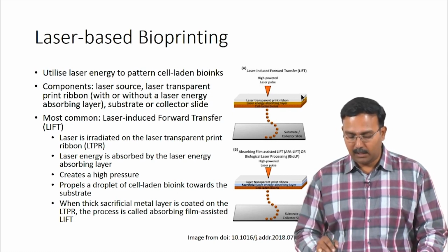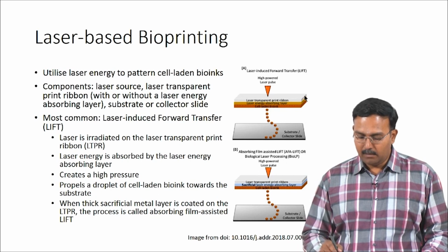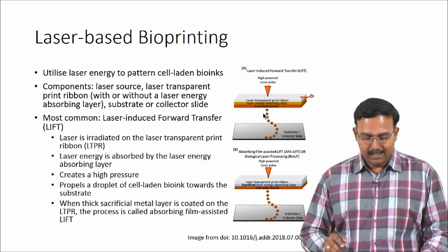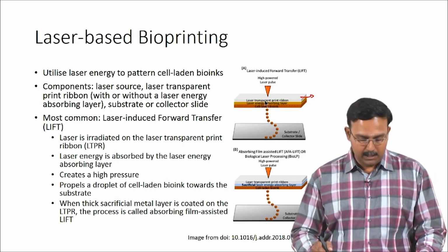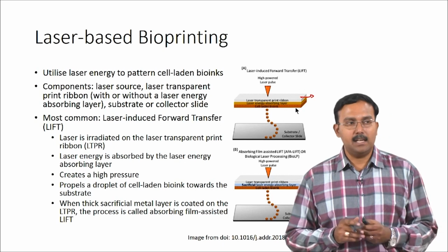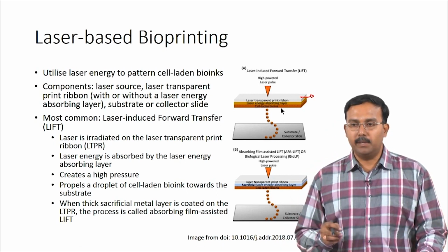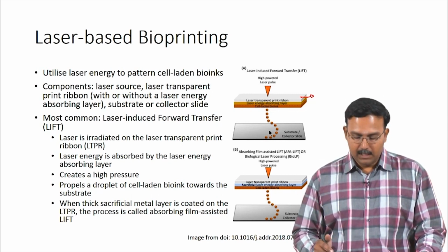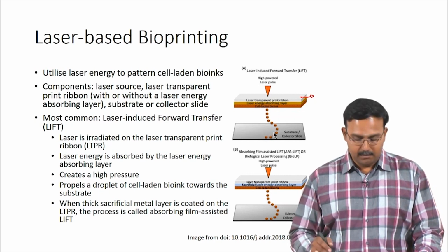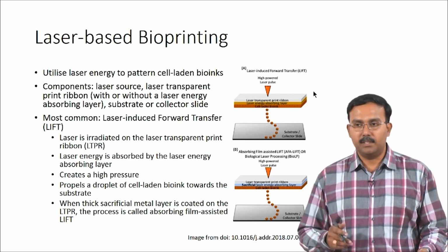The laser falls on the transparent ribbon, and a laser energy absorbing layer absorbs the laser energy, below which is the cell laden bioink. This creates a lot of pressure on the bioink and propels a droplet of the bioink, and these droplets are collected on the surface of the substrate, resulting in the formation of the 3D structure. So, this is the LIFT technique.